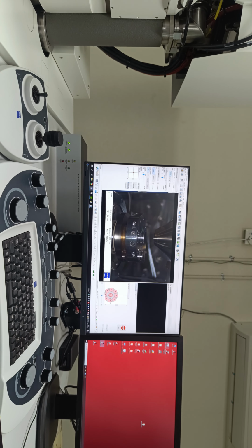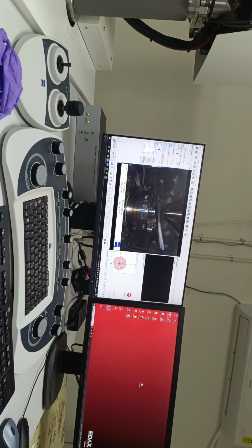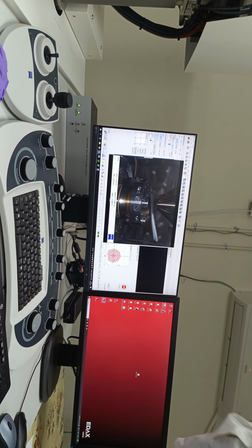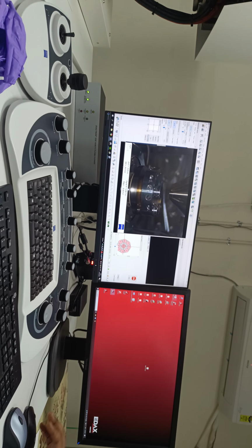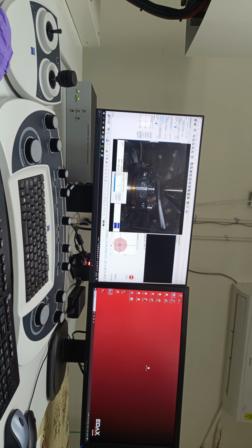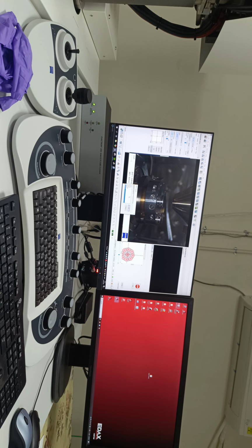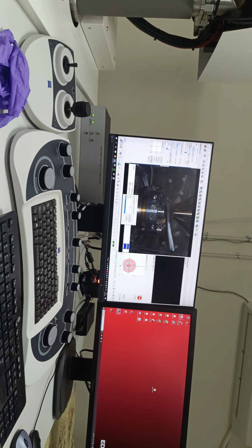This is the working distance. You remember I explained that by changing the working distance, you can control the level of signals that you are acquiring, and the working distance plays an important role. Depending on the detector that you are choosing, you have to change your working distance accordingly, and indirectly the sample also controls the WD. Depending on your sample, you have to change your accelerating voltage, and accordingly you change your WD.